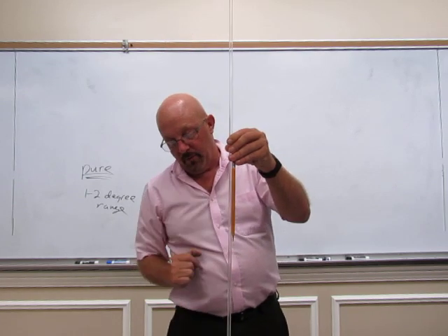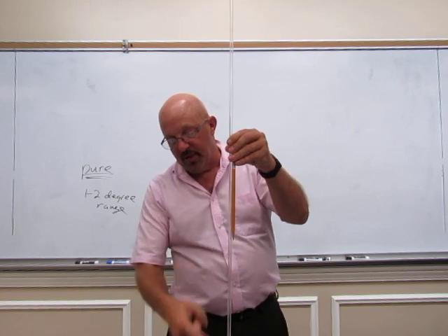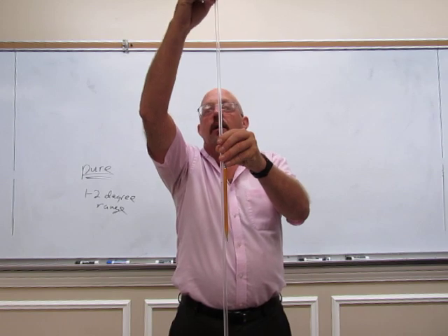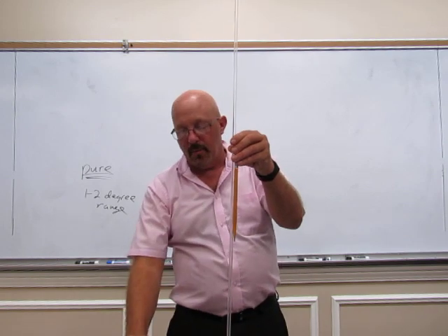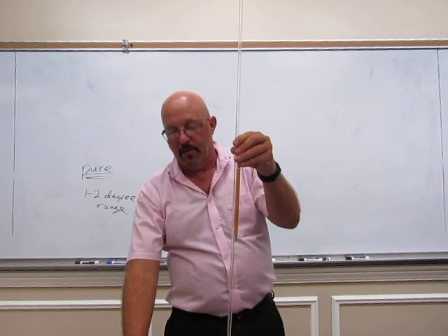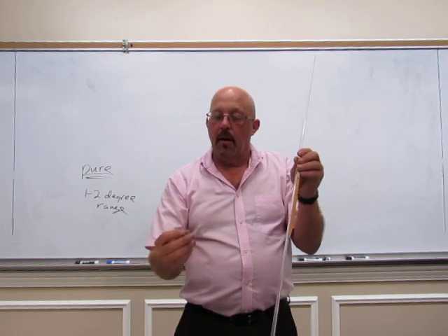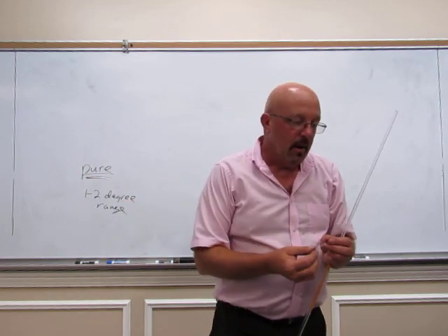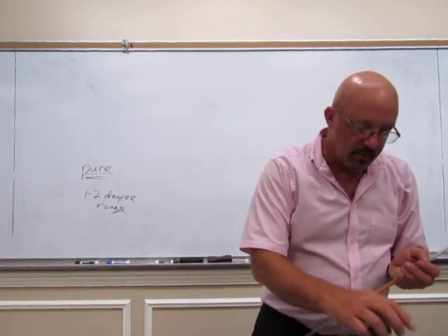And it will bounce. It just bounces and bounces and taps it down for you. Now you may have to drop it 2 or 3 times, but it will tap it down to that closed end. Once you've got it in the closed end, then you can put it in the melting point apparatus and measure your melting range.